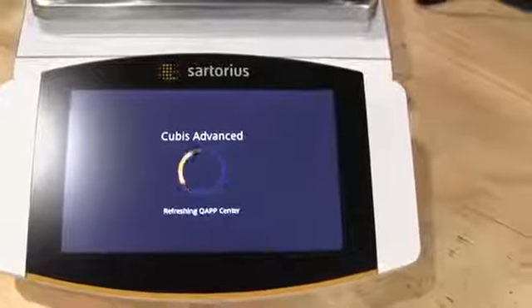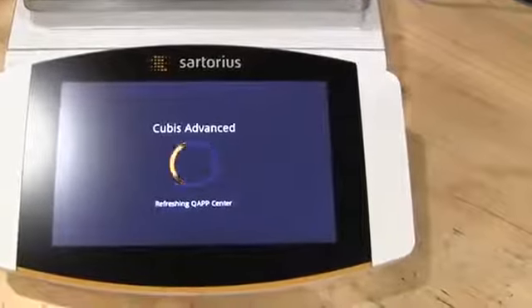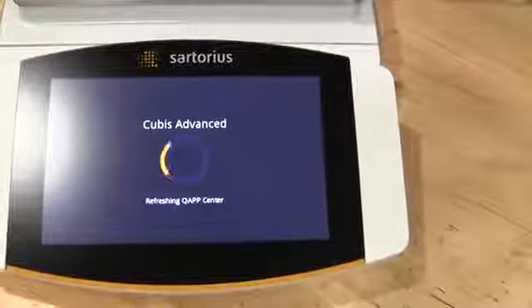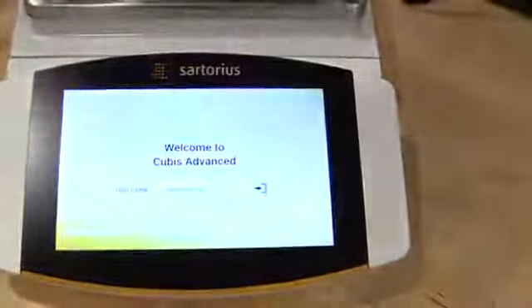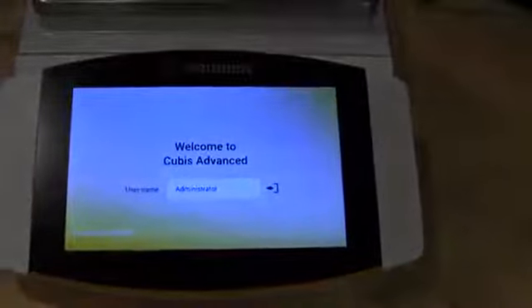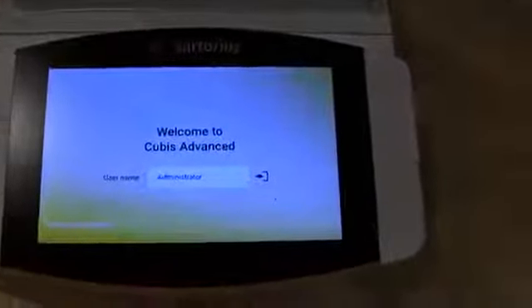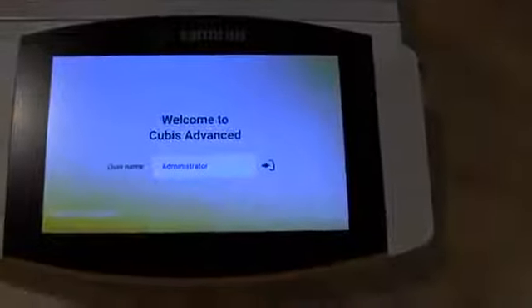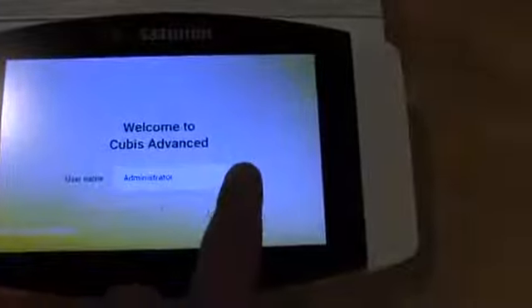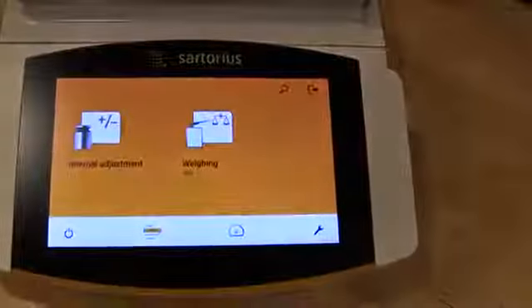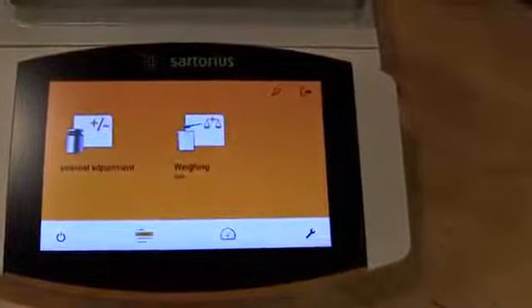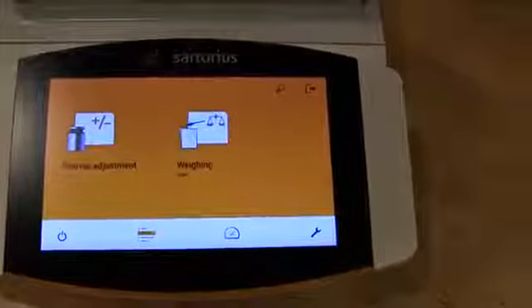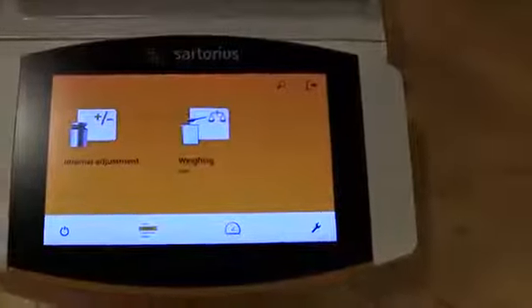You can see the balance is loading its profiles, it's refreshing its Q Apps. This particular model has all of the Q Apps loaded. You'll see here users, administrator, and then when the balance loads we can do an internal calibration.